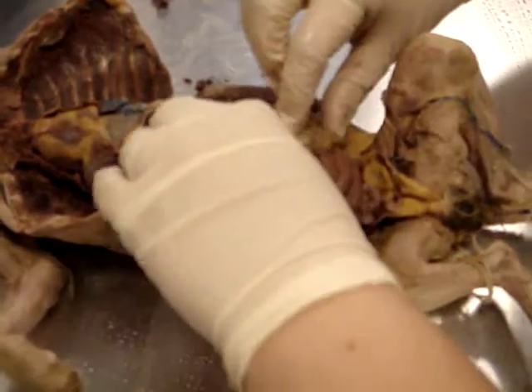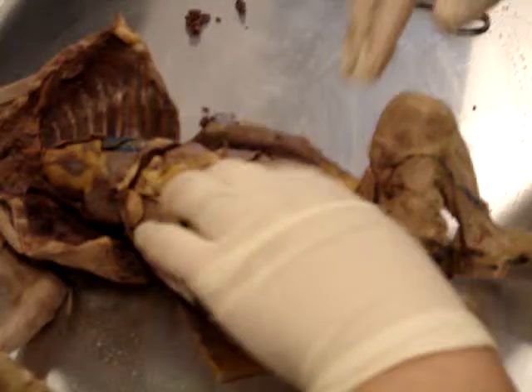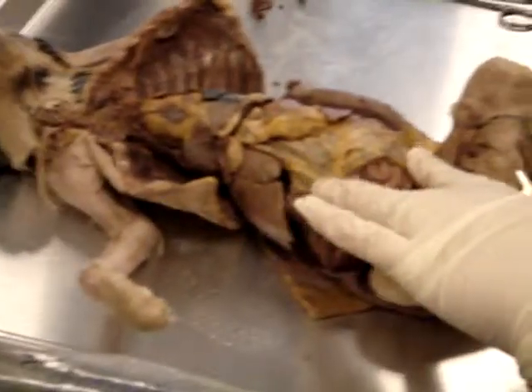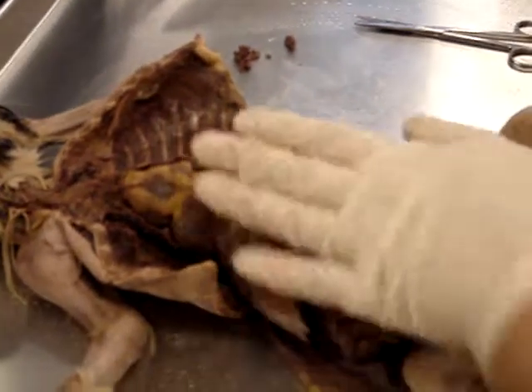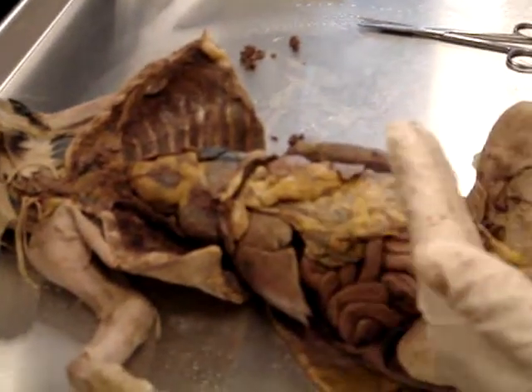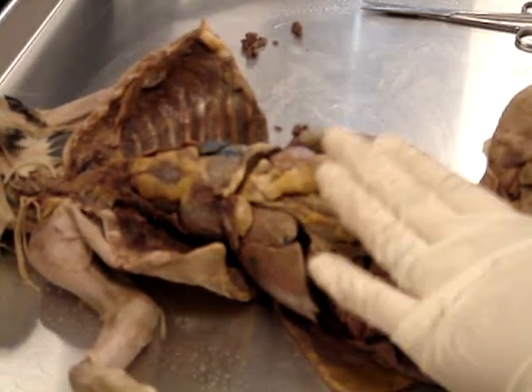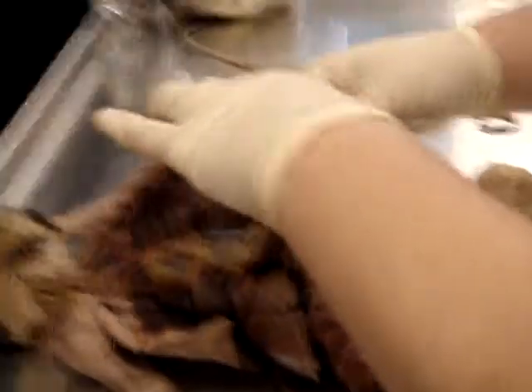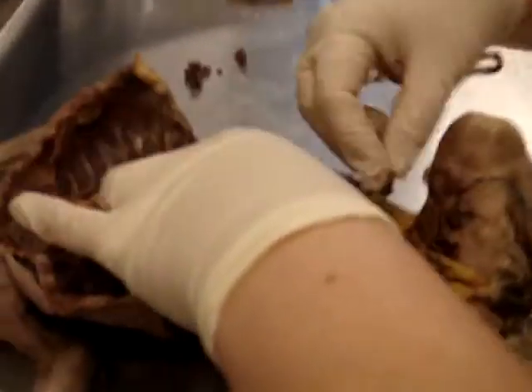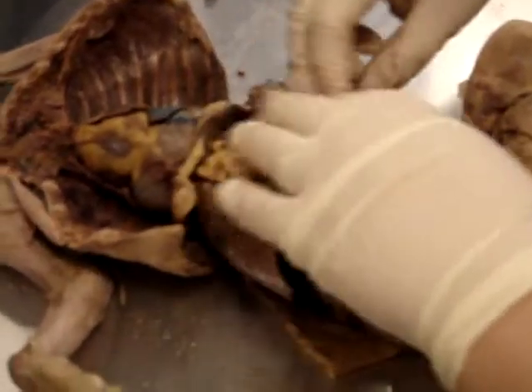Okay, so it looks like a sheet of fat, and what it is, this is called the greater omentum, and it is a double layer of membrane that kind of covers all of the abdominal organs, and it has a couple of interesting jobs. It can stop blood flow, like if there's an injury. Okay, so it does a couple of interesting things. All right, and so here's the greater omentum. It is attached to the stomach.